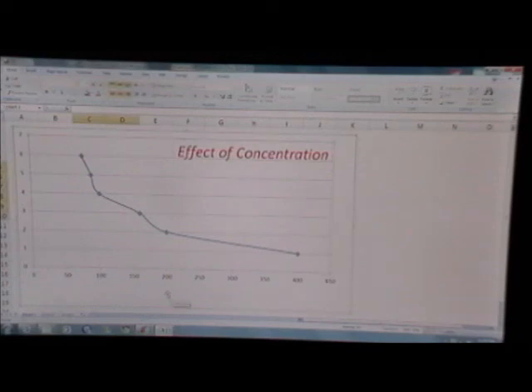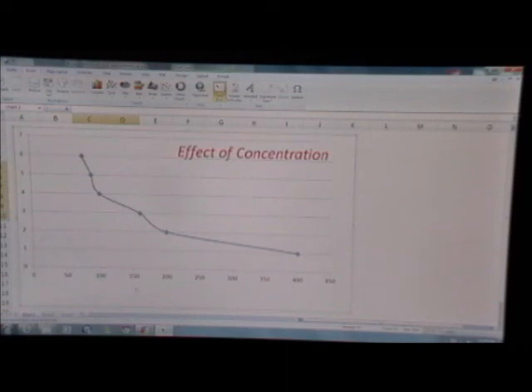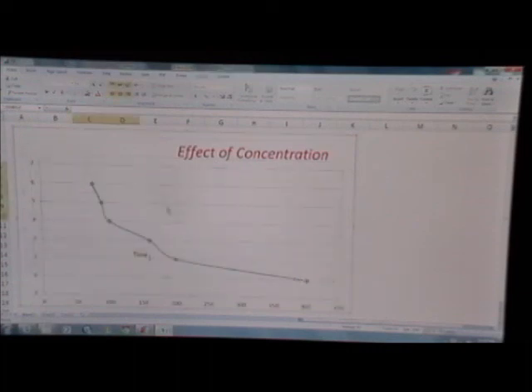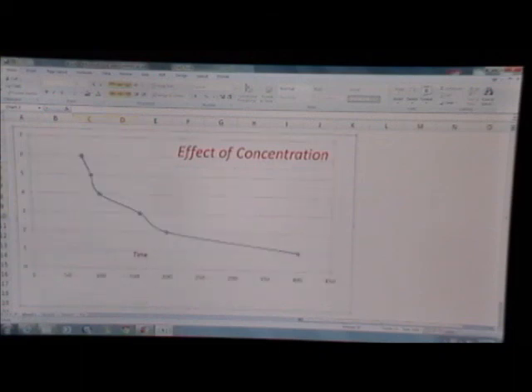Okay, and for the axis down here, let's put in another label. So insert again. Oops, and do that. Just try and grab the edges of the box. Just drag that down into the middle.